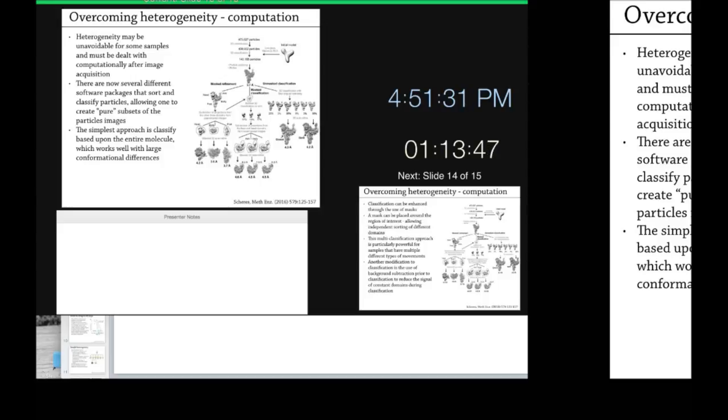So for example, if you have these in the unmasked classification, you have 3 classes with over 25%. Why didn't they pick the first one? Process the first one further. They might have, and it might have just been lower resolution, or it could have been a smear of these two. These are things that, if I had that, I would do exactly what you said. I would do a reconstruction of anything over about 5%, see if they're meaningful.